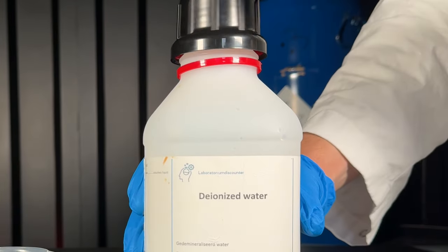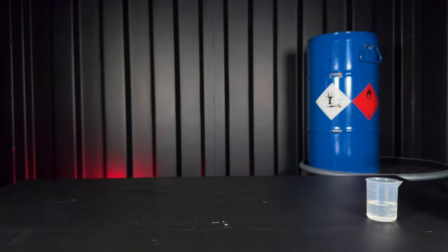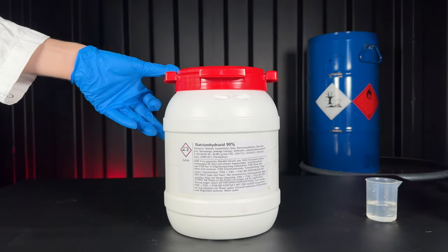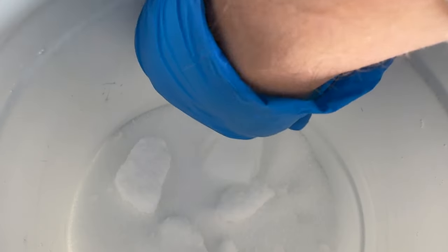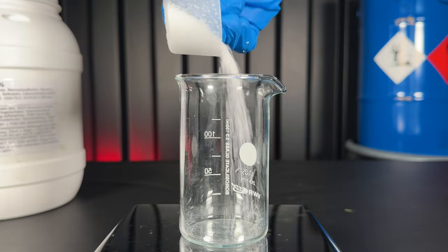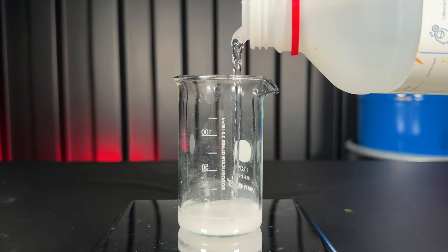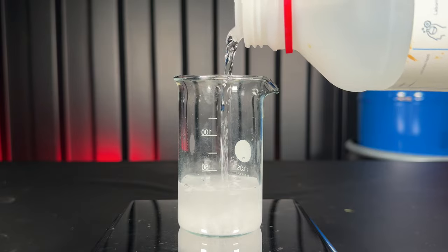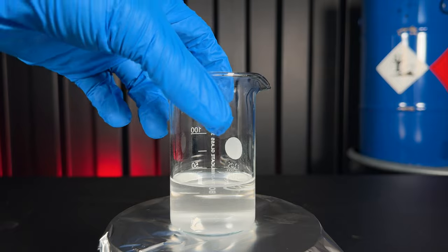I weighed out 8.5 grams of silver nitrate and dissolved it in distilled water. With sodium hydroxide, silver nitrate can easily be converted to silver oxide and I weighed out 4 grams of it. If I add the solid sodium hydroxide to the silver nitrate solution, it may get covered with silver oxide and the reaction won't be as efficient, therefore I dissolved it.